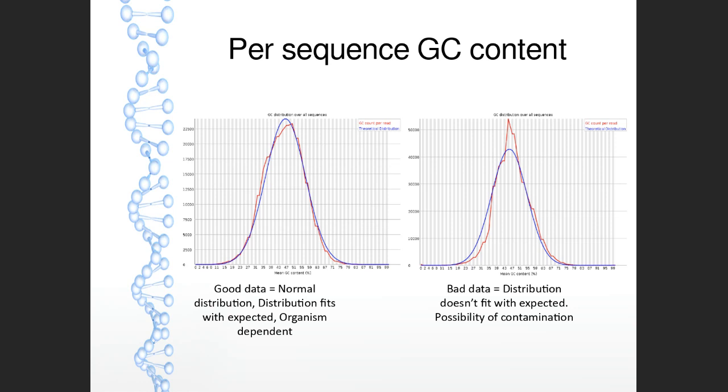What would be slightly worrying in terms of quality control is if we looked at our GC content within our reads and found that this didn't conform to a normal distribution. We might find that there is a peak at one particular point, or even worse, that there are two peaks. So not represented here, unfortunately, but one potential problem that we could highlight from this graph is if we saw a bimodal pattern.